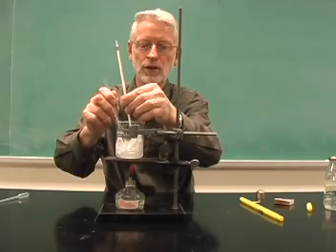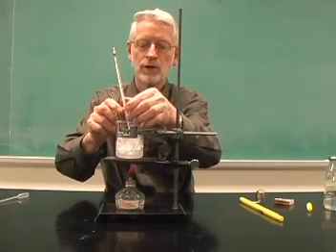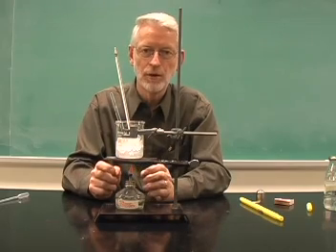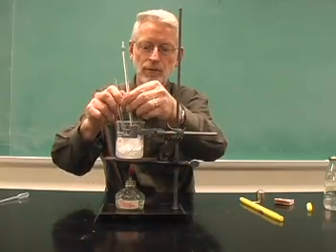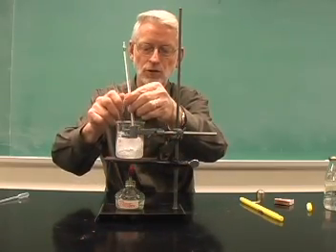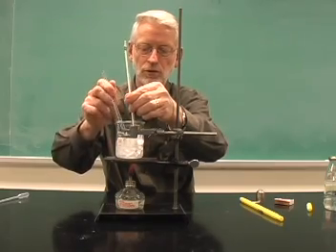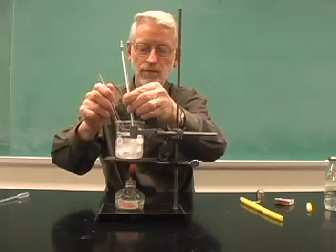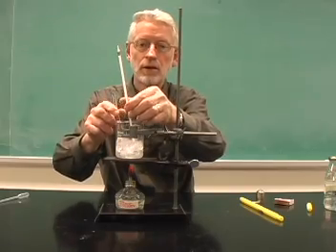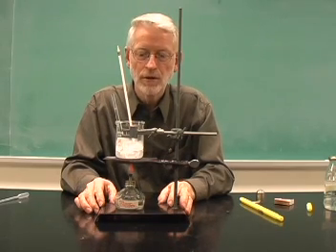It's not a good idea to use a thermometer for stirring because a thermometer has a very delicate bulb which can easily break if students stir a little bit too vigorously. So the thermometer is just used to record the temperature, not to do the stirring. The temperature stays at 0 degrees.